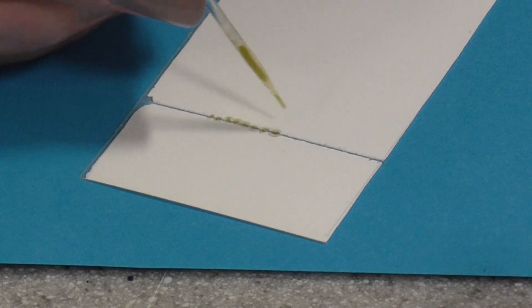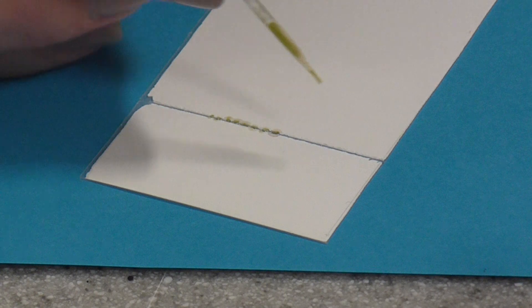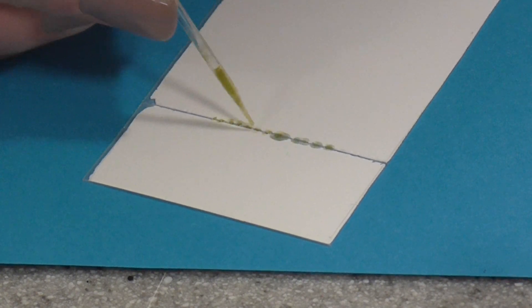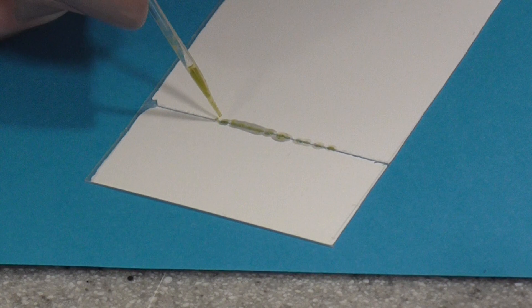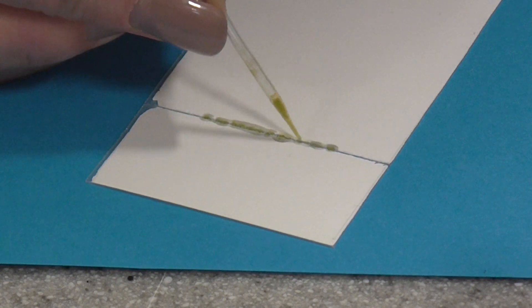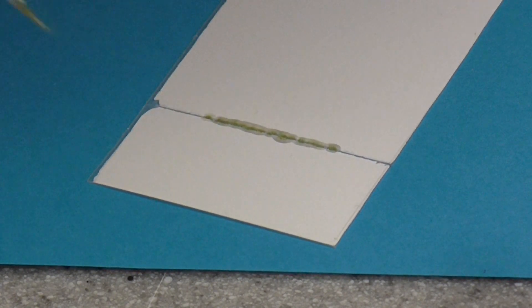Sometimes people are told to put a dot in the middle, but for this, it works better if you just dot along there and produce a kind of line of plant pigment, plant extract, at the bottom there.